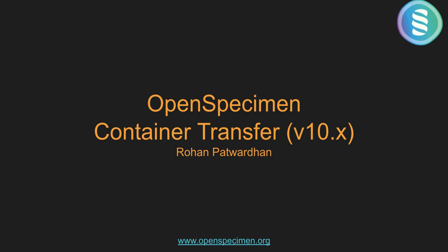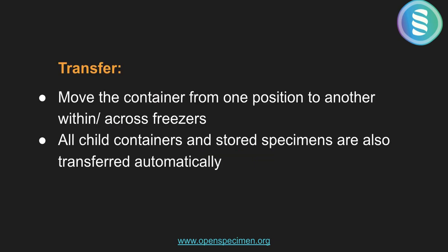Today I will be explaining OpenSpecimen container transfer related enhancements coming with version 10.x. Transfer was supported in OpenSpecimen from many previous versions, but many freezer facilities requested that they need to move or transfer multiple containers at a time from one place to another.